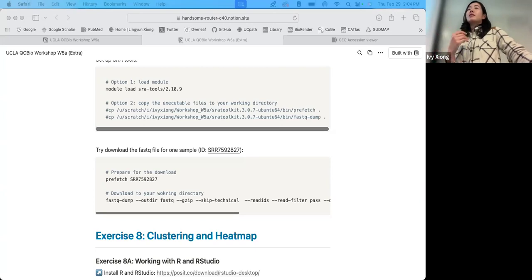In my case, there are germline data and tumor data, so you better characterize them and put them in separate folders. That's helpful, because I wasn't sure whether I have to delete my folder, labeled workshop, until I move it into the projects folder. I see. Your home directory is only maintained by you.